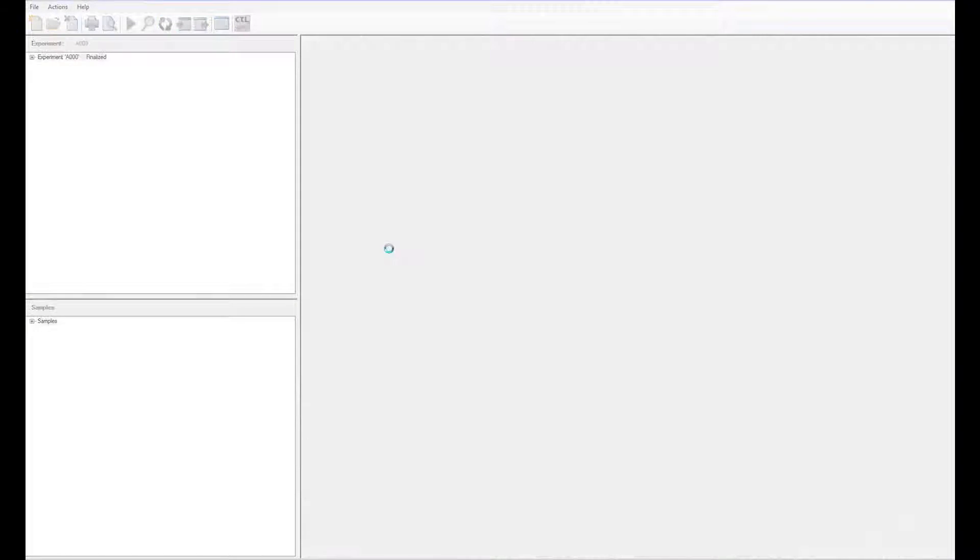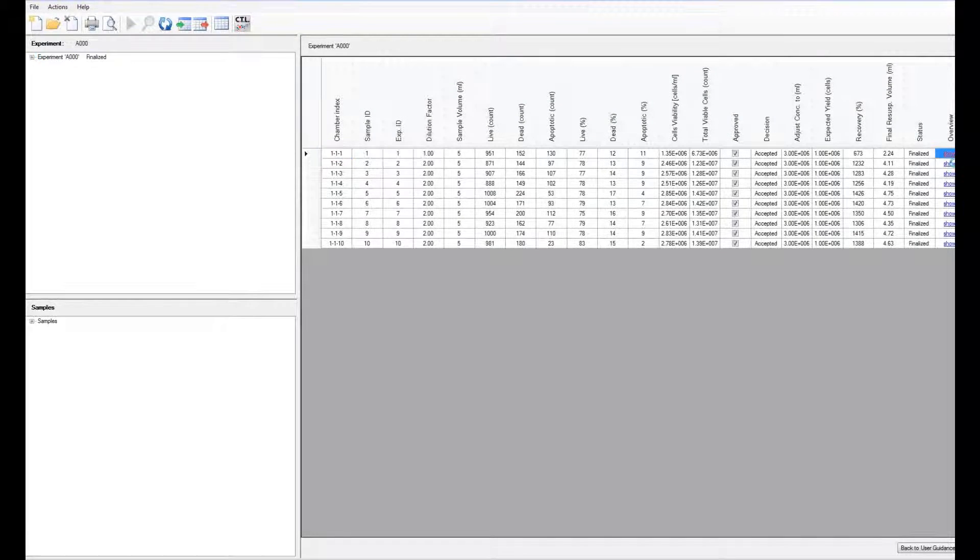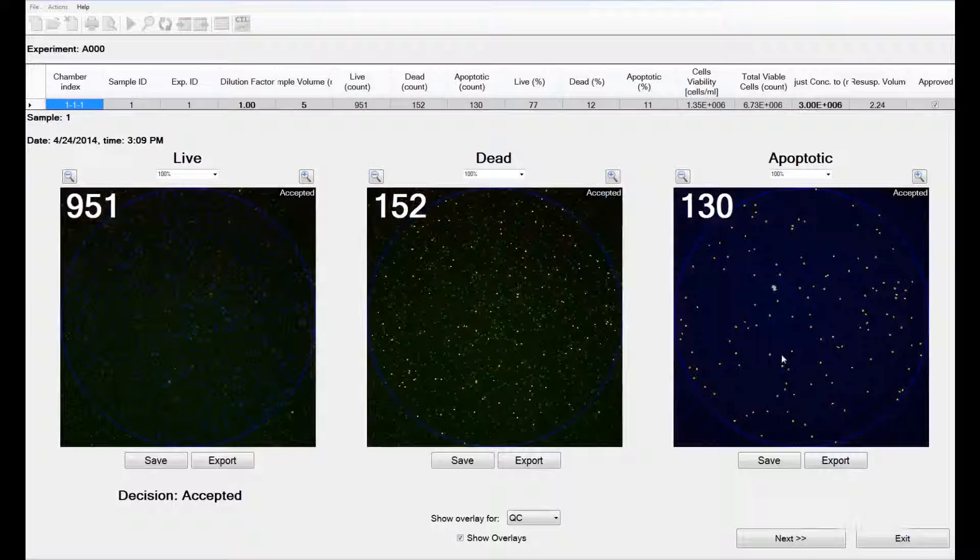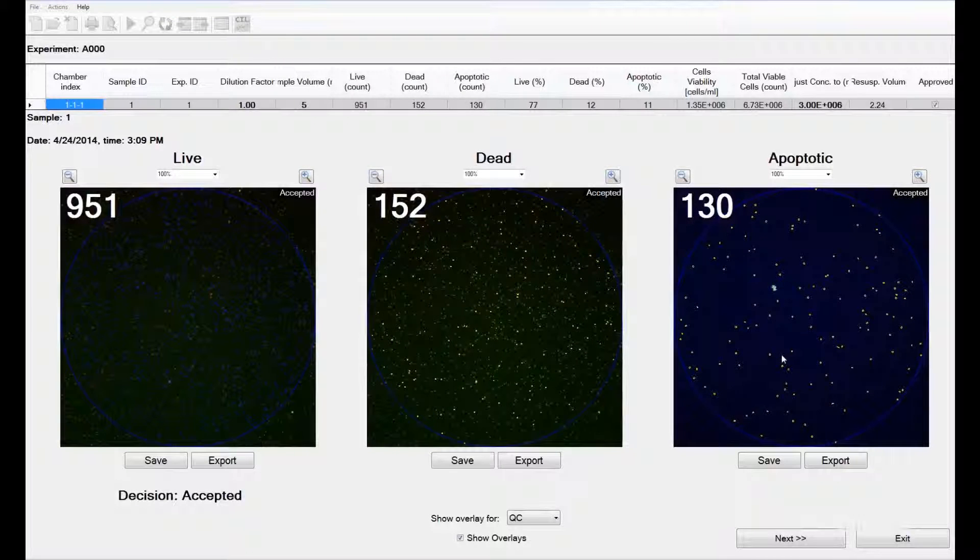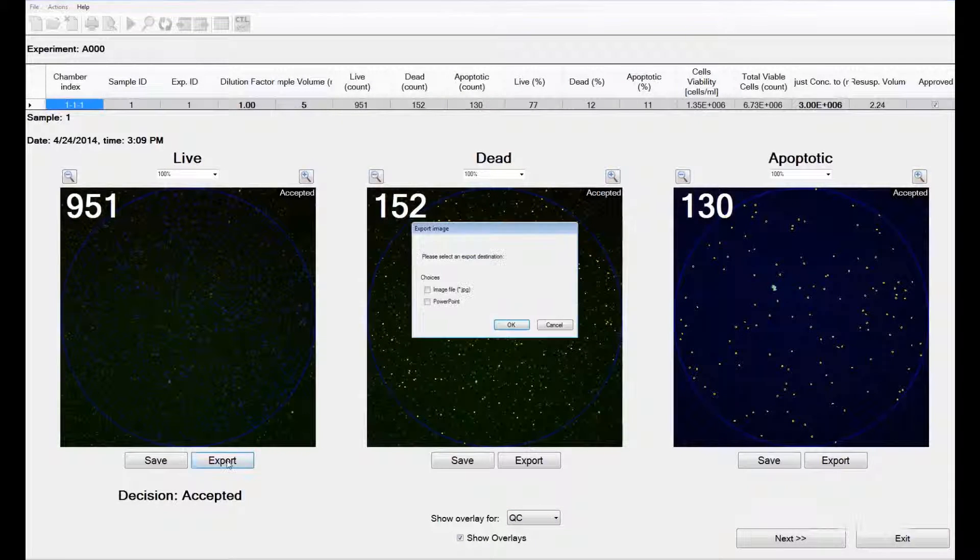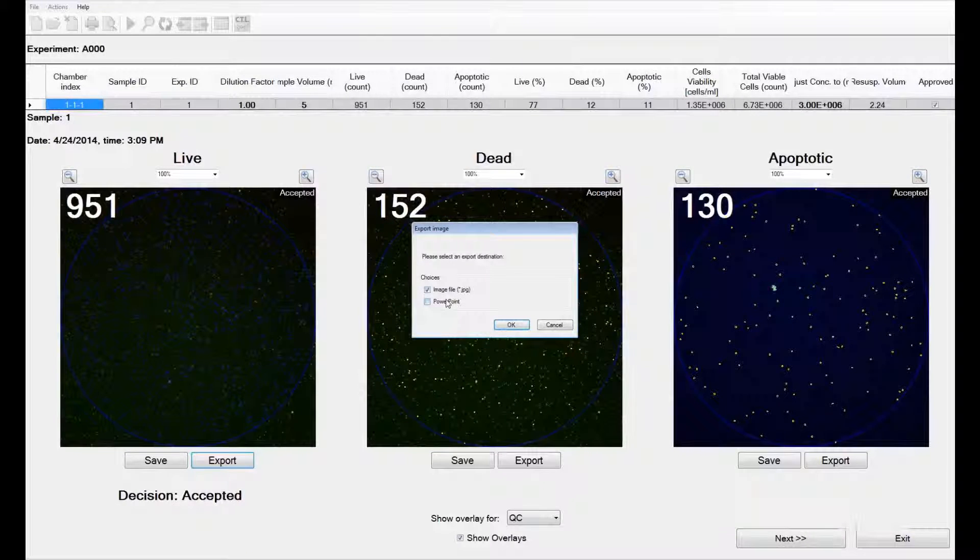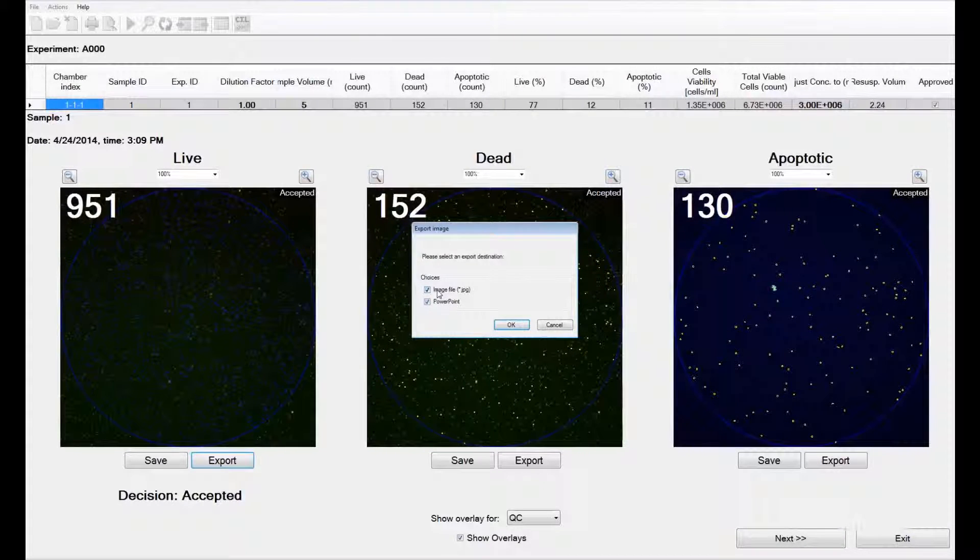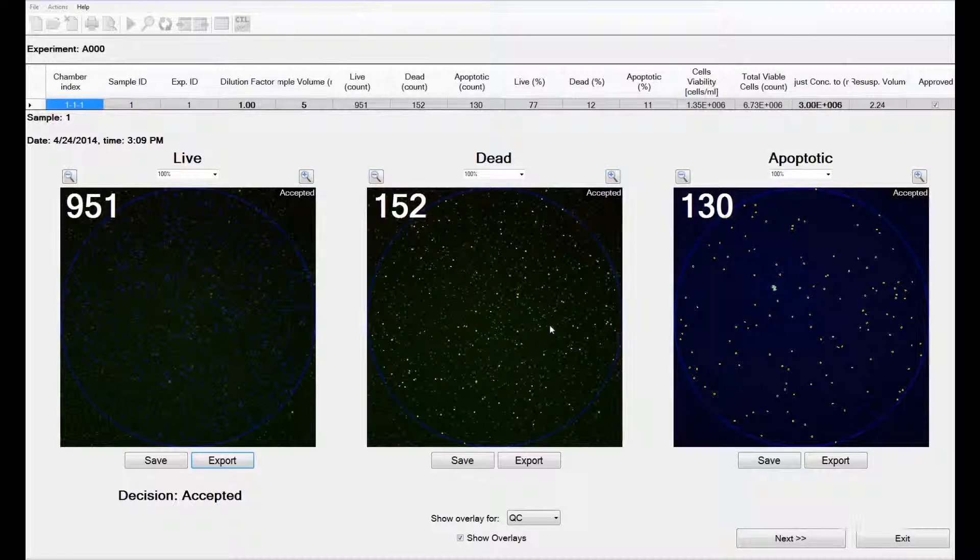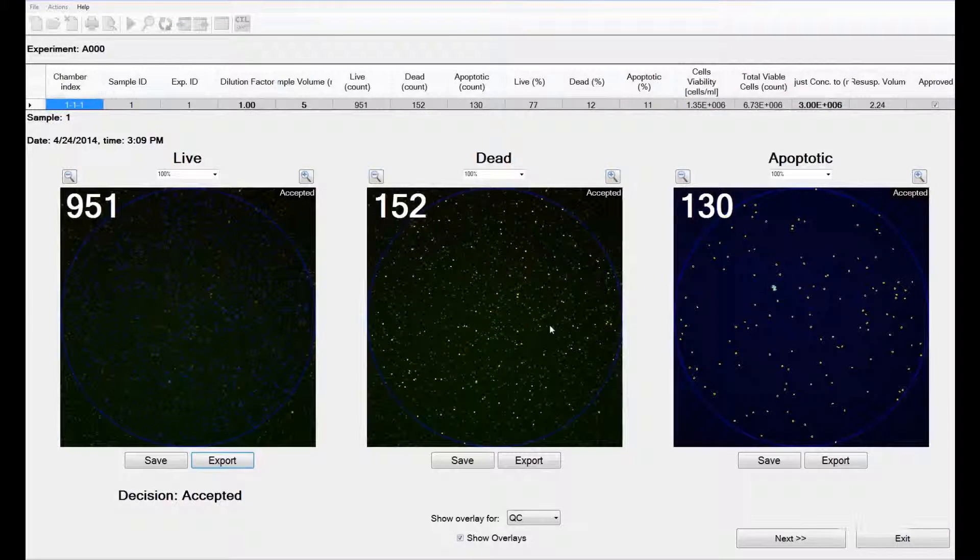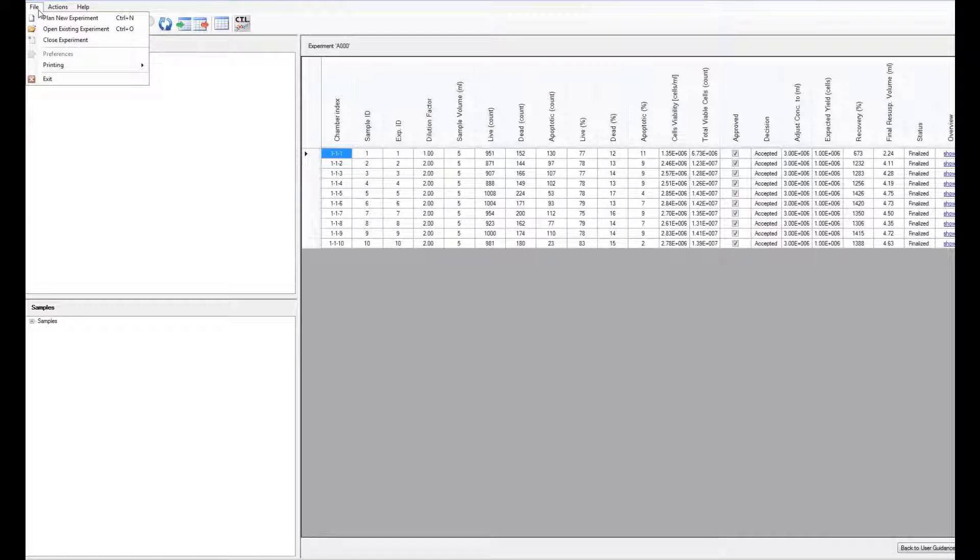You can also view the Summary table, which allows you to see the final overlays, just as you did in the Quality Control mode. From this, you can export the images as an image or as a PowerPoint, which can be used for presentations and such. This concludes our demonstration of counting a set of samples.